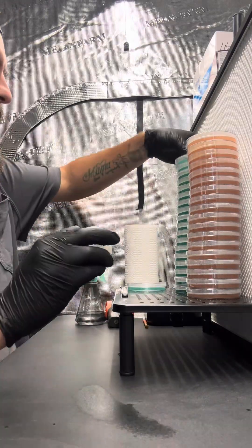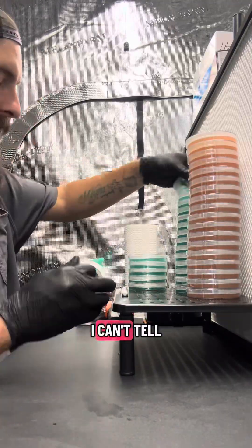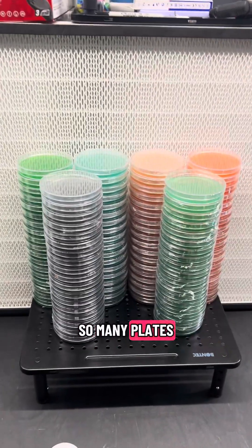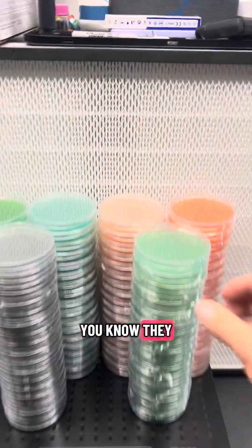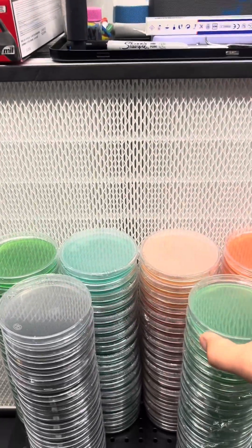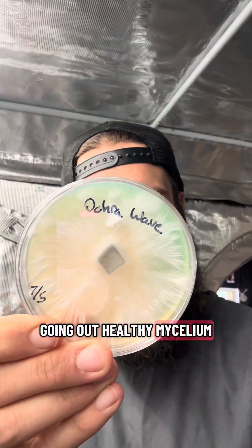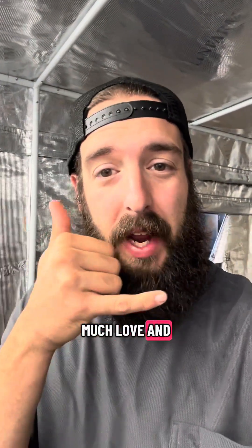This is more of the tedious part of the job — I can't tell you it's my favorite part, but it needs to be done. Once you get the method down, you're going to be pouring so many plates, it's absolutely awesome that you can do it yourself and they turn out really nicely — super clear, no contamination. Once you get the technique down for pouring plates you can start growing out healthy mycelium. I hope you guys liked the video, I hope you learned something, and as always, much love and peace out.